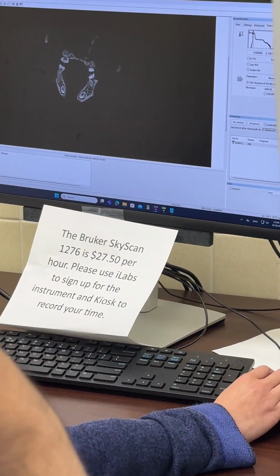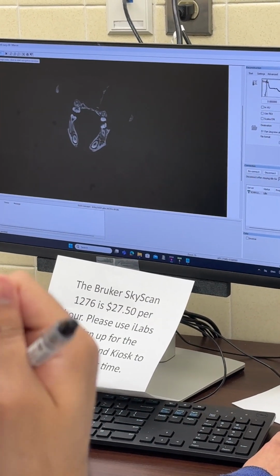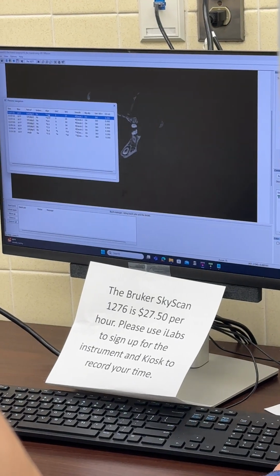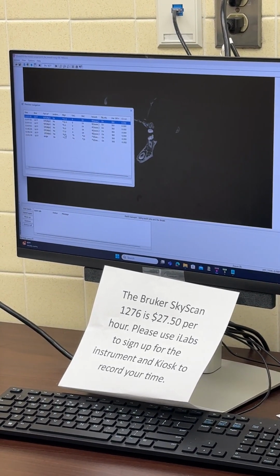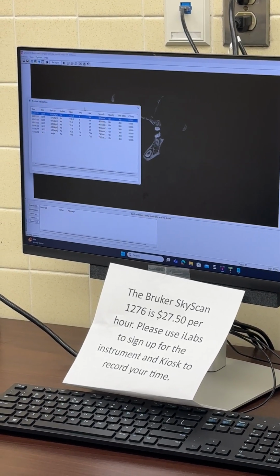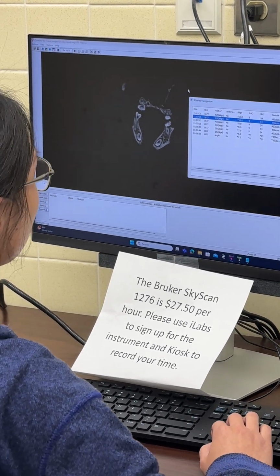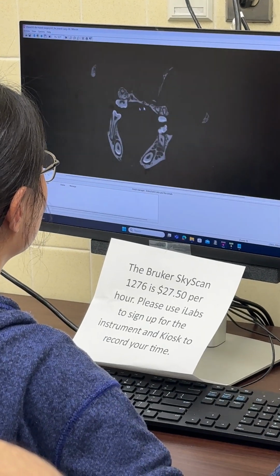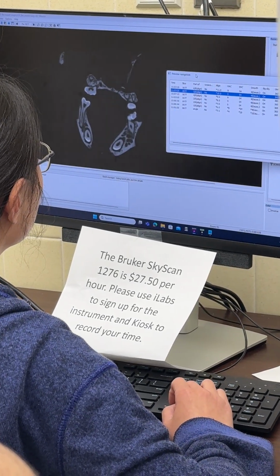Okay, we are adjusted. It's already like the computer runs a few trials, and then we left click this button. So you will see the alignment. I set 9 as a baseline. So the software will set 6 different steps from 6 to 11. Then we put this window here, and I just switch between different ones to see. Zoom in a little. Which is the best number here?